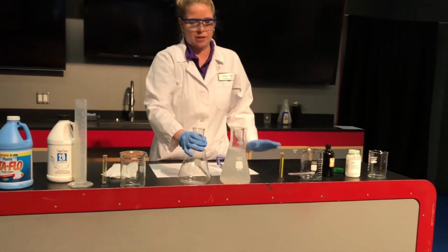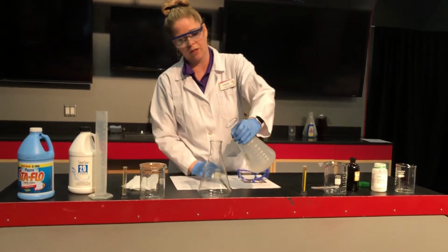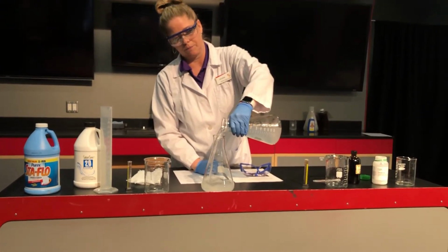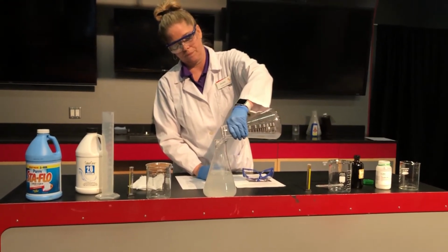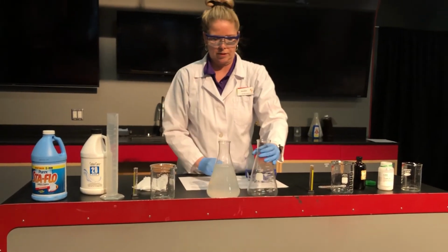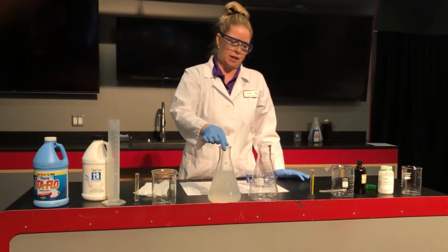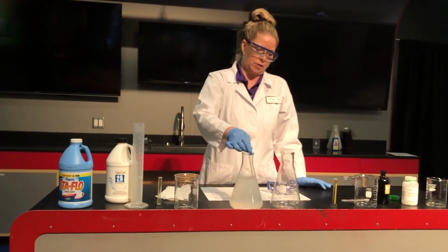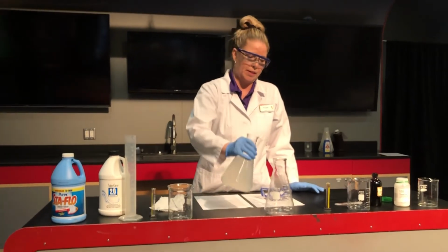And sometimes when we do this experiment, we tell everyone to think ink, because we want to turn this dark enough that we could almost use it as ink. Still don't have a change. Still just going to let it sit, have the timed reaction go off. What do we think is going to happen? Sometimes it takes a few minutes.